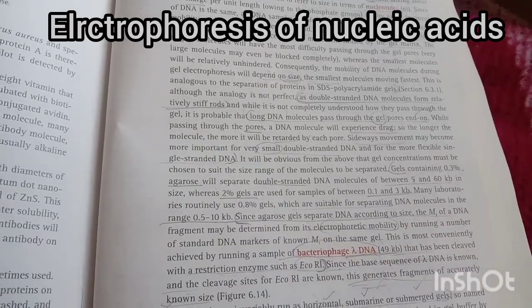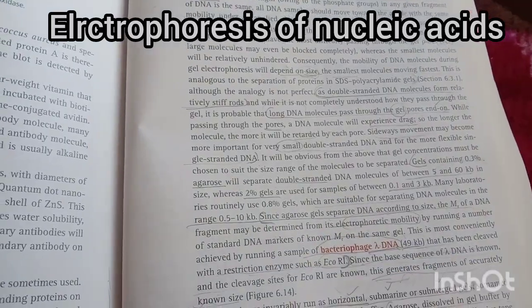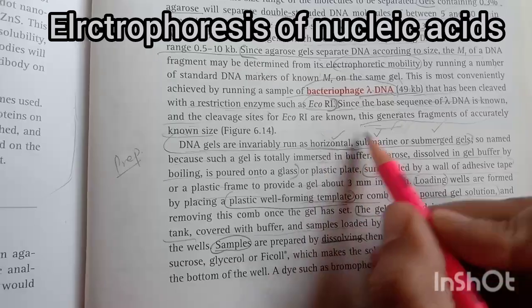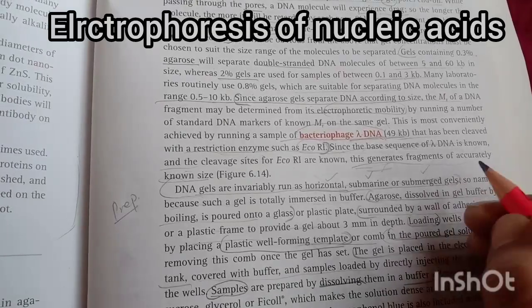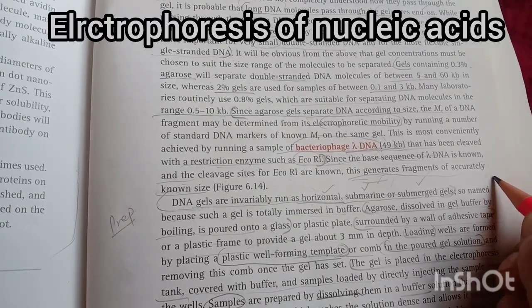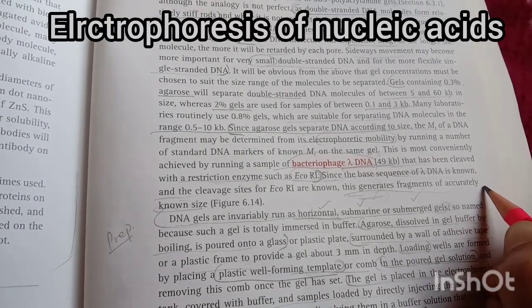Now if we talk about gel preparation, this is the preparation of the gel. DNA gels are invariably horizontal, submarine, or we can say submerged gels. Agarose gels are buffered and made by boiling. This is the agarose gel we are boiling here. After that we pour it into the glass.